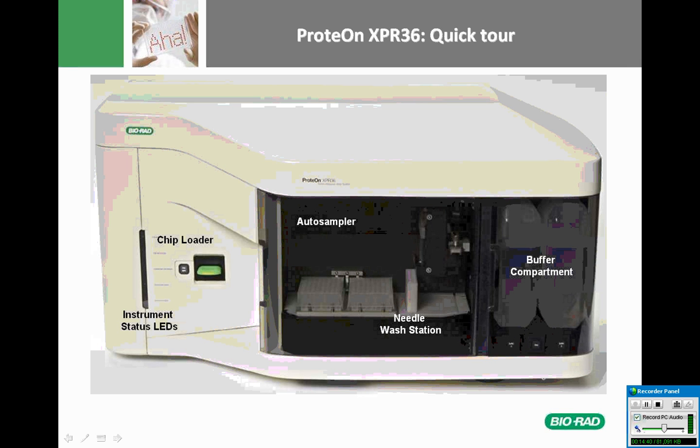This is very convenient because if you need running buffer A for the immobilization of ligand and running buffer B for your analyte, you can easily switch between them or enter a command in the protocol when you set it up. On the left side is the chip, with all the optics behind it, and there are of course status LEDs which indicate the progress of your experiment and the instrument status.